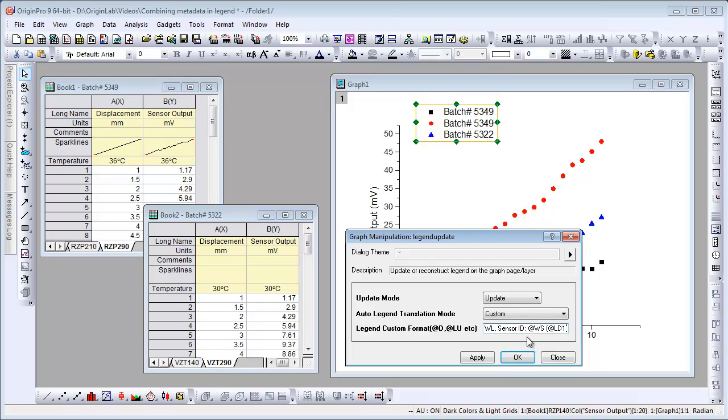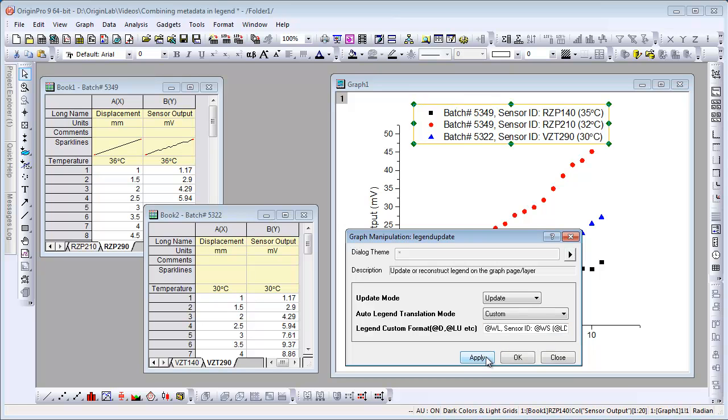Complete documentation is available on those substitution notations in our help file. And now you'll see that all of that can be displayed as part of your origin graph legend.